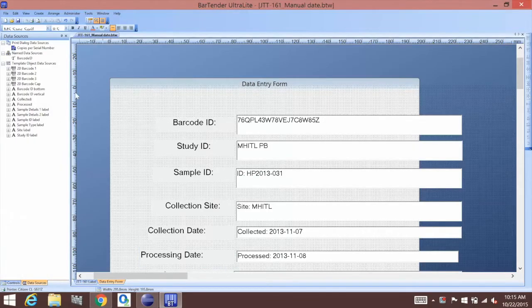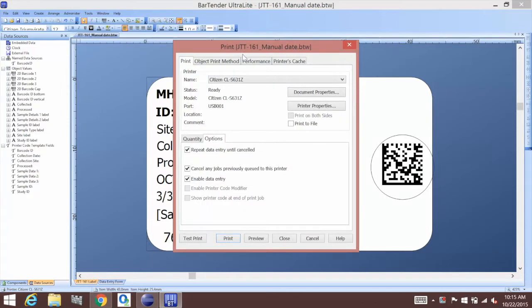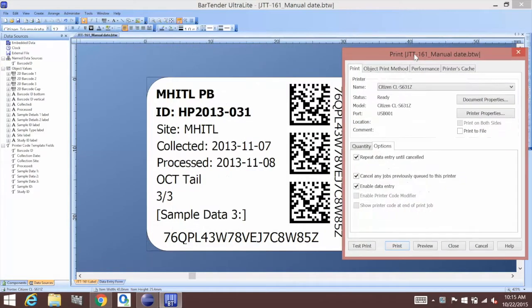That's where the Canadian Biorepository software comes into play. It's a great tool that allows us to keep track of patient information, sample inventory, location, as well as distribution.